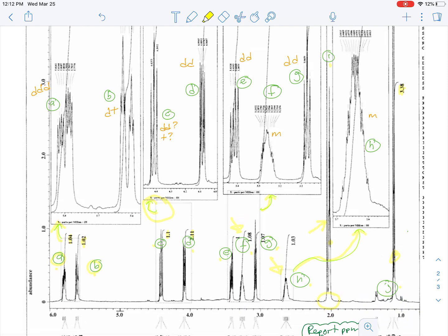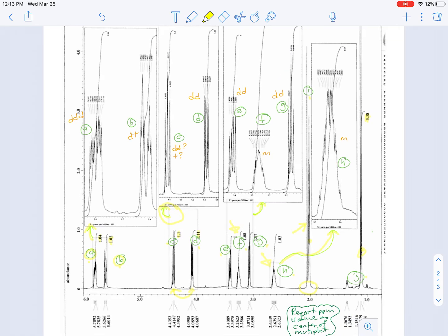Well, it turns out that there are many mysteries that we can solve in this spectrum with the use of proton-proton COSY. One of the things that we cannot do is figure out which one of these is which diastereotopic hydrogen of the methylene that's next to the oxygen, but the rest of them we can figure out pretty well.